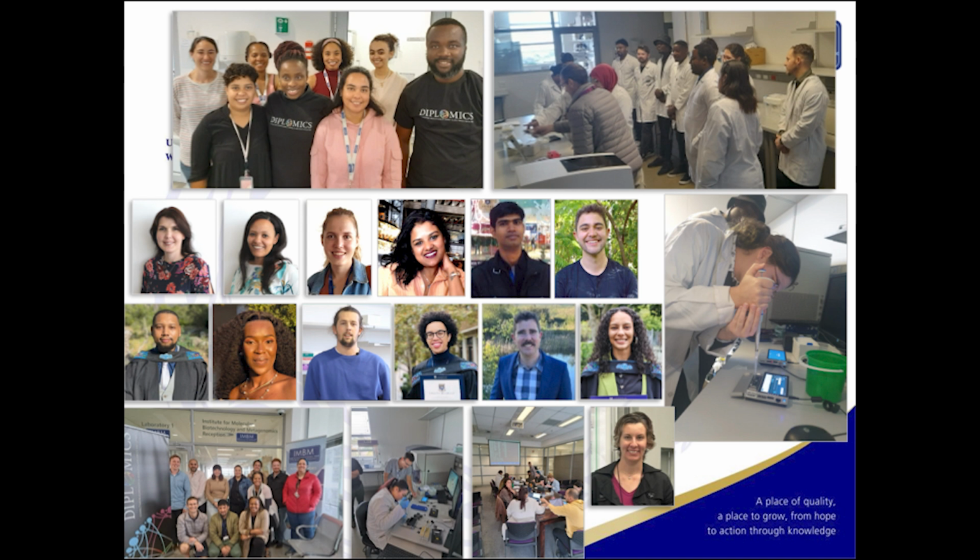And then lastly, just to say, this is the effort of very many people. So we run annual workshops to train people in Oxford Nanopore sequencing, again, with the help of Diplomics. And we actually take these opportunities to sequence small batches of these genomes that have made their way into the collection. And in that way, like I said earlier, we can train a lot of these folks.